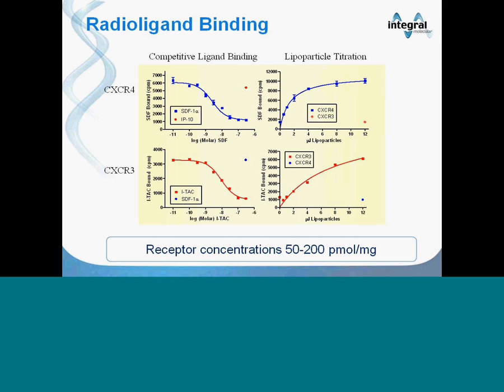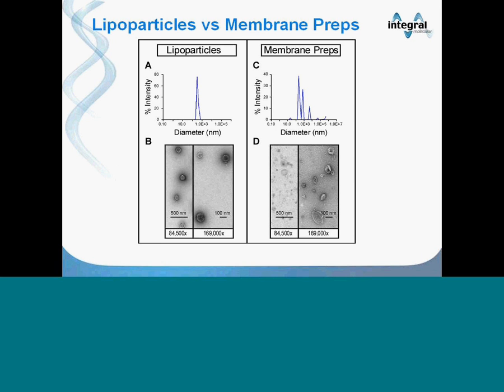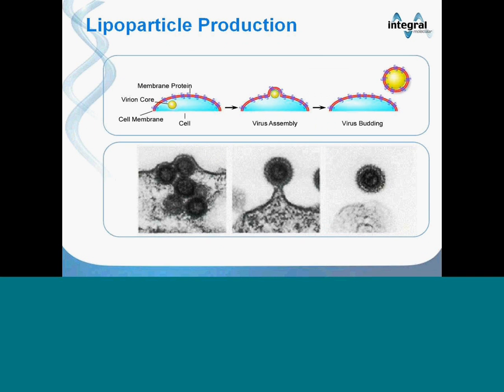Any other questions? Actually, yes, one more. When you are binding to captured antibody or your lectins, approximately how much lipoparticle do you need to inject to get the kind of RUs that you're immobilizing or binding?